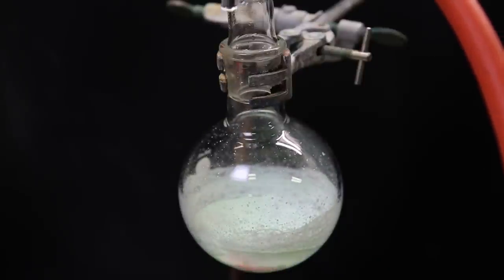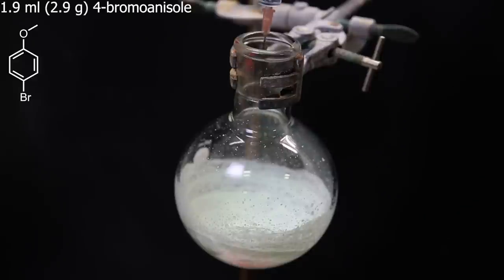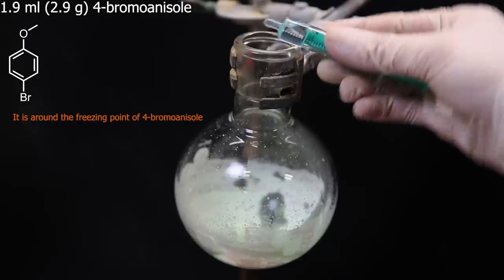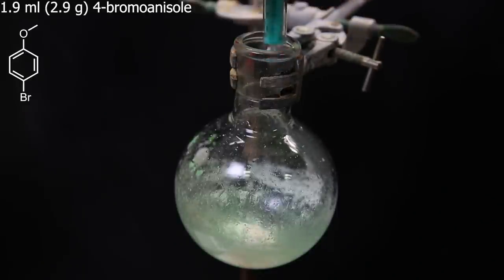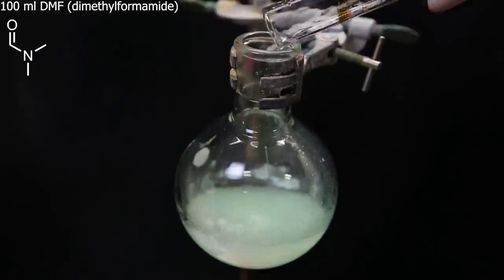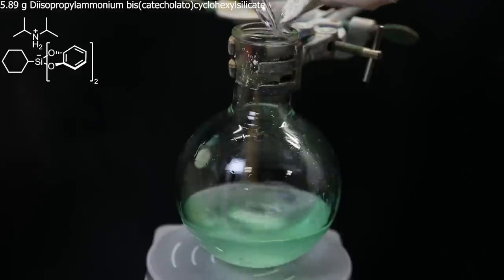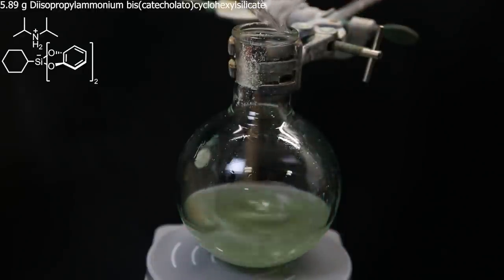I then open the flask again and add in 1.9 mL of 4-bromoanisole as the first reagent. The needle managed to get clogged, so I had to take it off, resulting in a not-so-elegant addition. I then add 100 ml of DMF as a solvent and stir it to give a green solution. I now add 5.89 grams of the silicate reagent that I made before, and the solution turns a dark green.